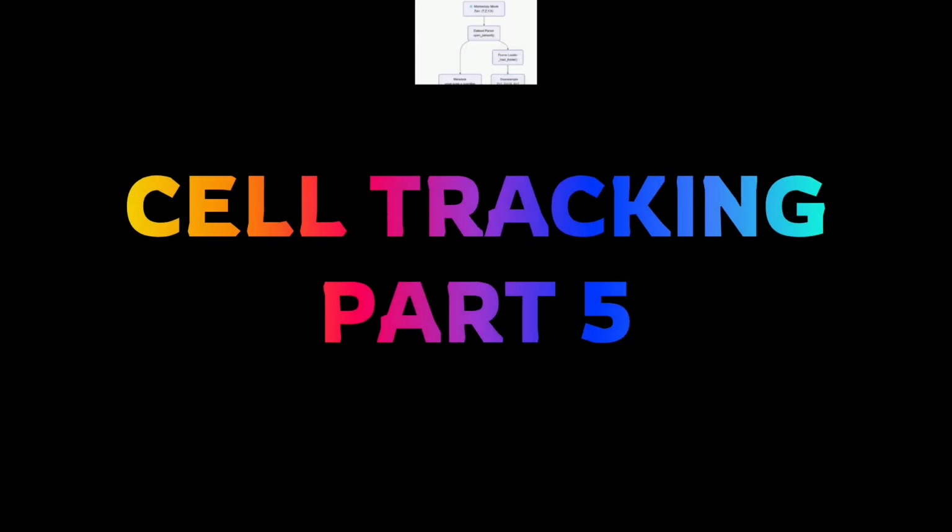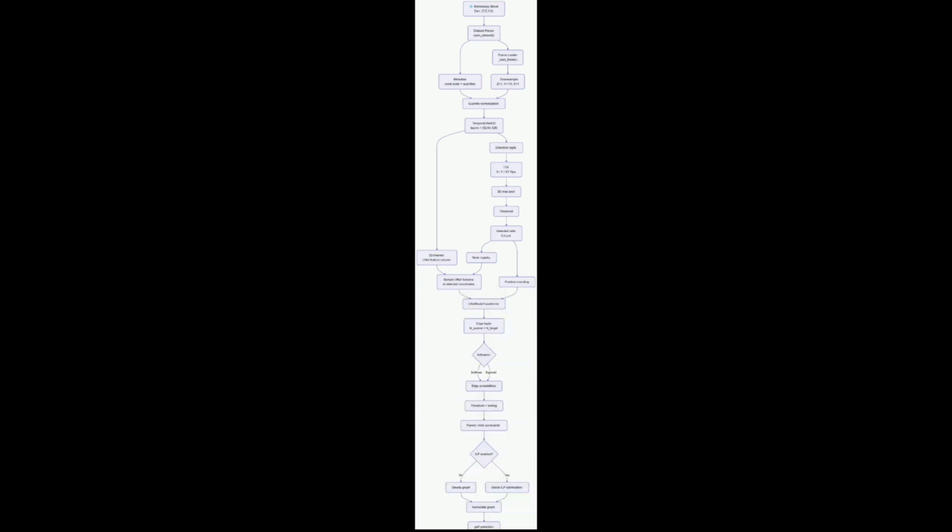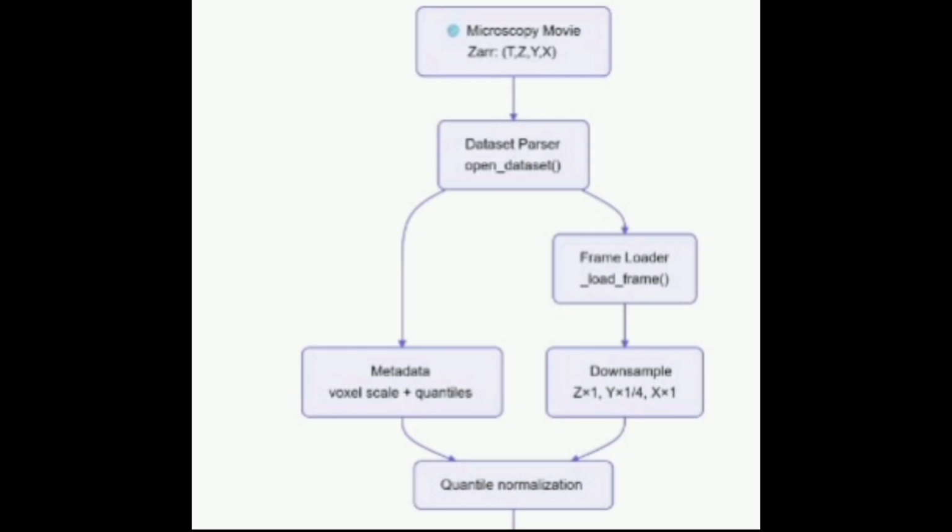Now, to recap, how does the entire pipeline work, from microscopy videos to a cell lineage graph? Let us understand the pipeline altogether. We start with the 3D microscopy time lapse, and our data is organized in 4 dimensions.